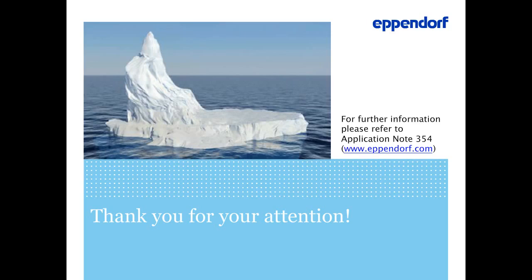Okay, at this time, I'd like to ask another question. The question is from Levy, who says, when I aspirate liquid quickly and it splashes inside the cone, how do you prevent that?